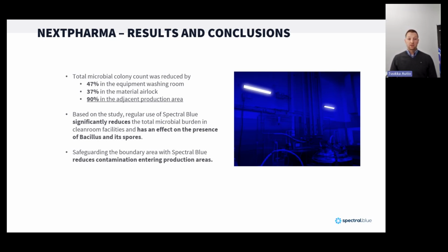The bacillus and spores were tested also, but the calculated amounts were so tiny that it's difficult to show a statistically significant effect, but we didn't observe any bacillus entering after the test.